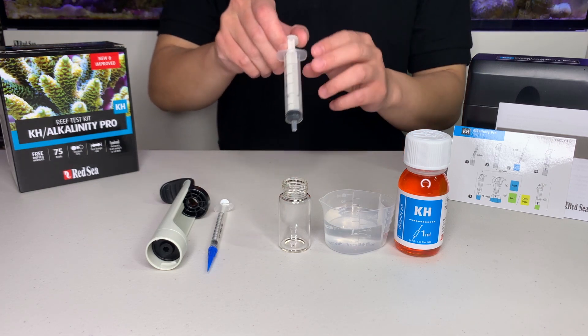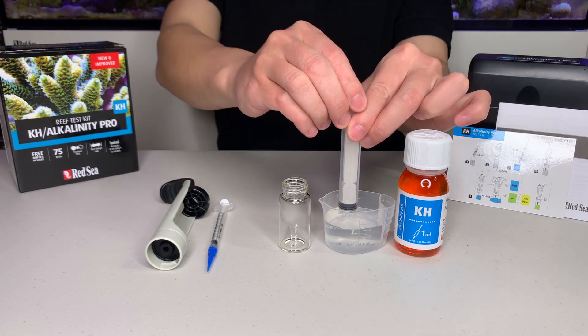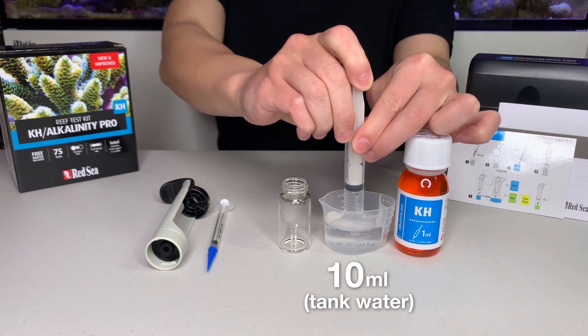First, use the large syringe provided and place exactly 10 ml of water sample into the glass vial.